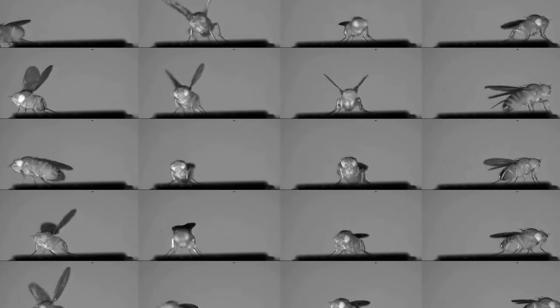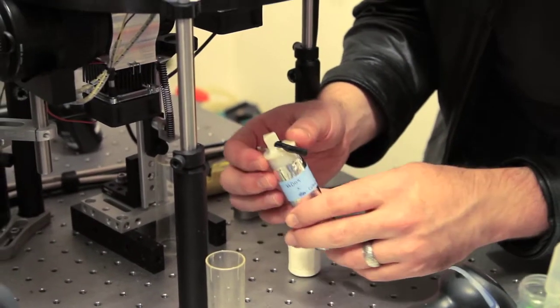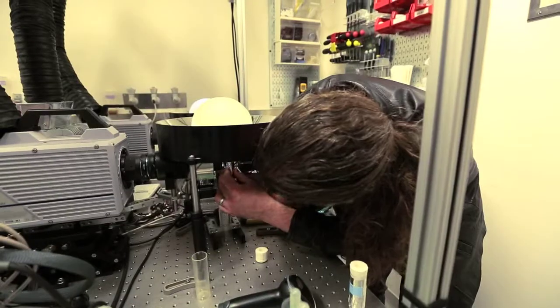We need to be able to look at a lot of flies performing this reaction. So we've built an automated machine, which we call the Fly Pez because it dispenses flies, similar to the old candy dispensers.